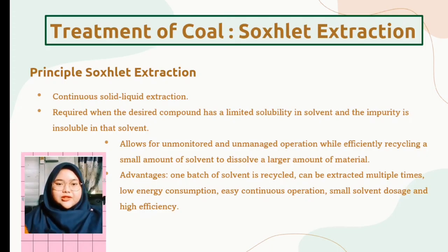The principle of Soxhlet extraction. The principle of Soxhlet extraction is that it is a continuous solid-liquid extraction. Soxhlet extraction is required when the desired compound has limited solubility in a solvent and the impurity is insoluble in that solvent. It allows for unmonitored and unmanaged operation while efficiently recycling a small amount of solvent to dissolve a larger amount of material.